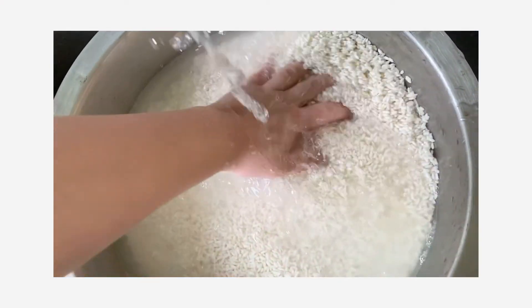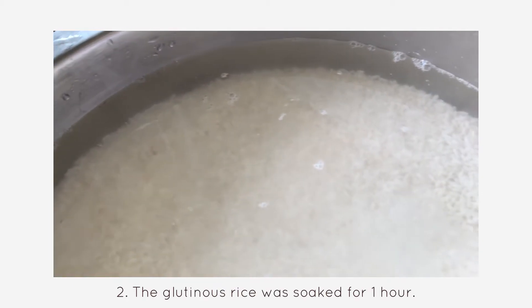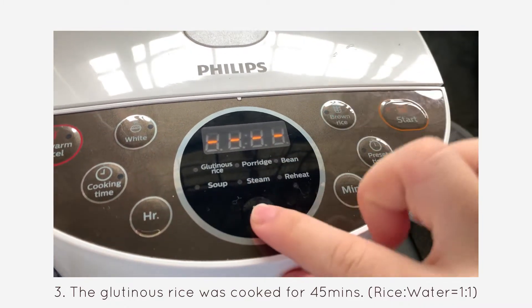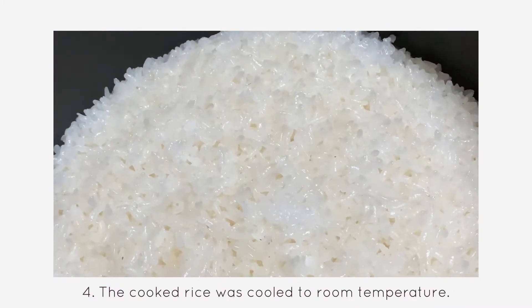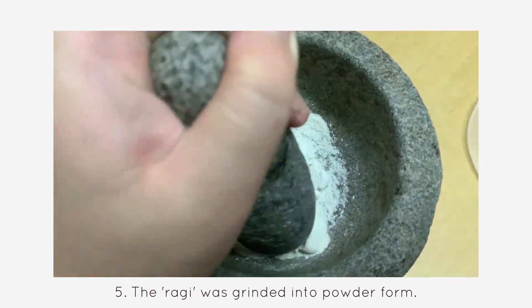In the beginning of the tapai making, the glutinous rice was washed thoroughly. Next, the glutinous rice was soaked for 1 hour. The glutinous rice was then cooked for 45 minutes. The cooked rice was cooled to room temperature. While waiting, the ragi was ground into powder form.